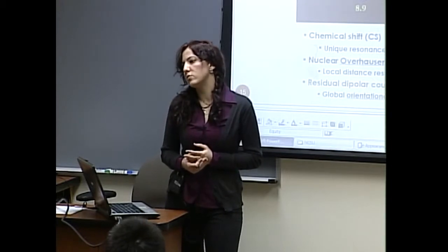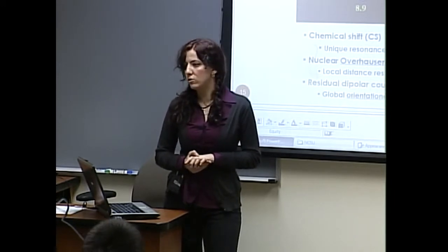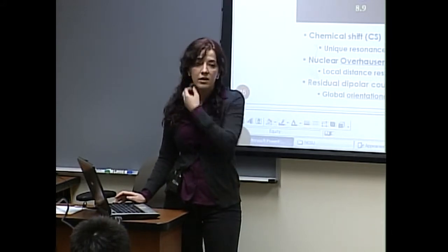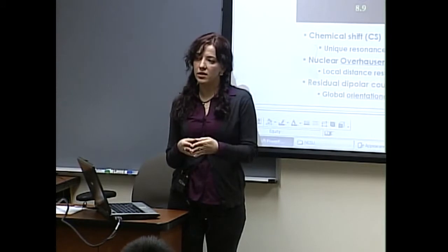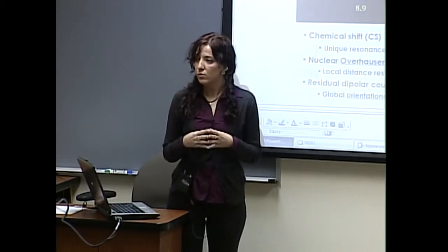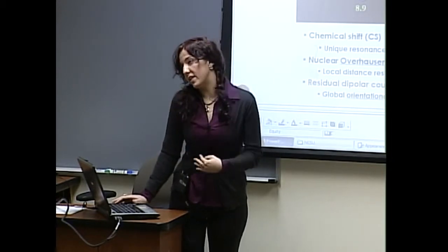If you have just the sequence, that's what in these protocols we have only sequence in the beginning and some data with no geometric information whatsoever. Do you think that at some point it would ever be possible to predict binding site based on just amino acid sequence? Well, that's what they're trying to do using molecular dynamics, yeah. However, it's not always reliable because proteins can fold differently depending on temperature and solution, and therefore once you put the purified protein solution in the spectrometer and you obtain the data, you really want to know what that conformation is. And that's why it's better to guide structure determination based on the NMR data that we obtain.